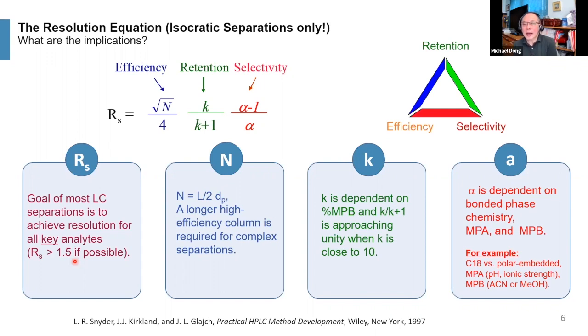Now on the other side, you have purity assay, you have stability indicating assay. That is really important, right? We want to know everything about a sample to protect the patient's safety. We want to know that the drug substance or drug product contain only the API plus a limited amount of impurity and degradation product, and we know the shelf life of your drug product after doing a lot of stability study. So the key analyte is really everything. You want to make sure everything is eluted. You want to detect the API, separate it completely from all the process impurity and degradation products. So ideally, we have a baseline resolution, which is 1.5.